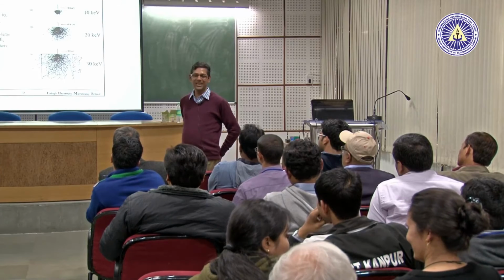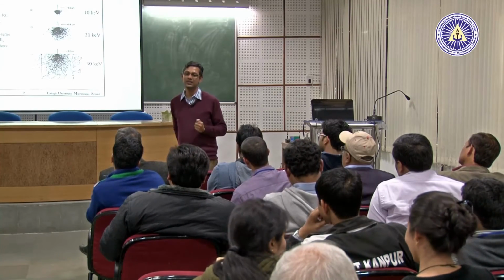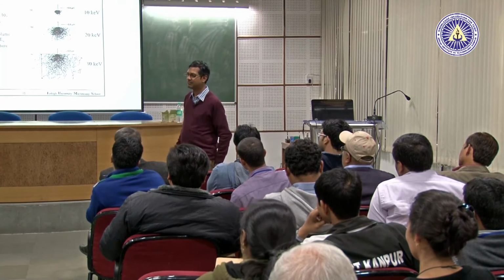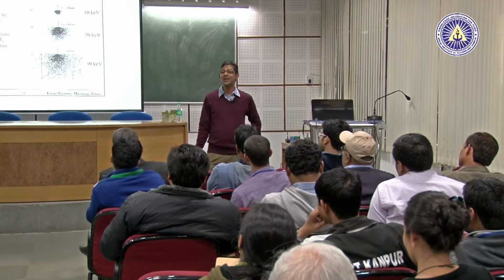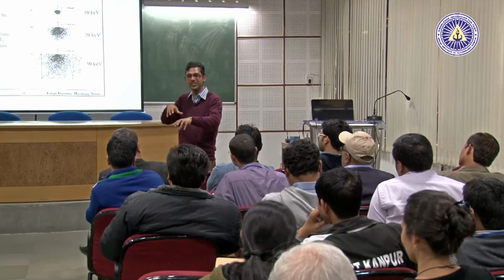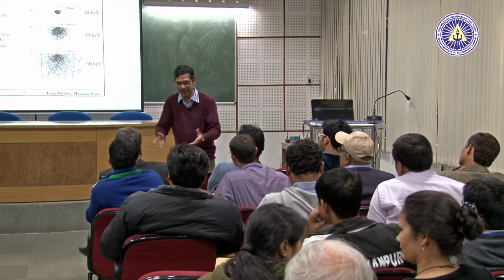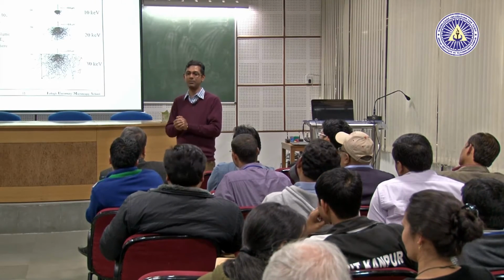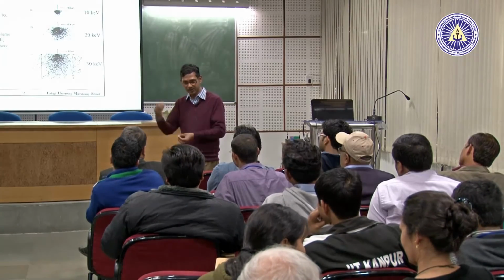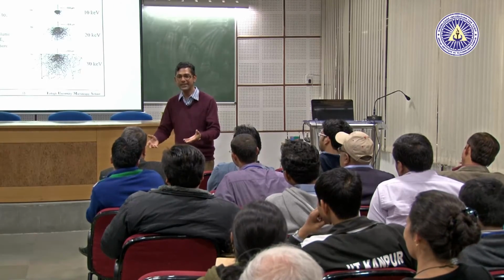You really do not see atoms. You cannot see atoms. Why? It's because of Heisenberg's principle. The position and velocity have uncertainty, correct? What you see is a potential. Even in AFM, what you see is a potential. Every atom has a potential, like electrons have a potential, and you map that. In the AFM, the tip is moved up and down because of the interatomic potentials, and that is what is getting mapped.